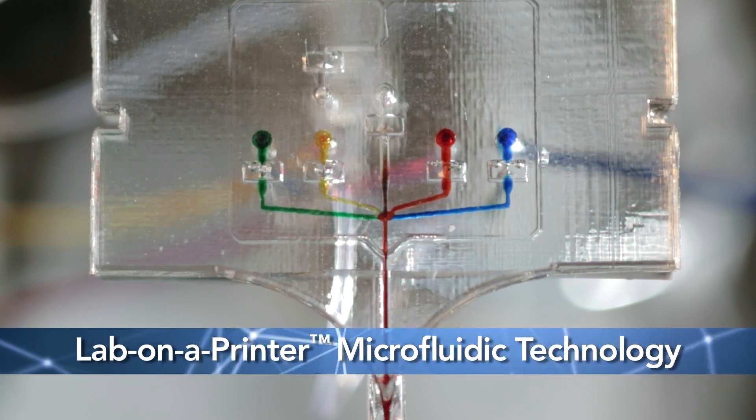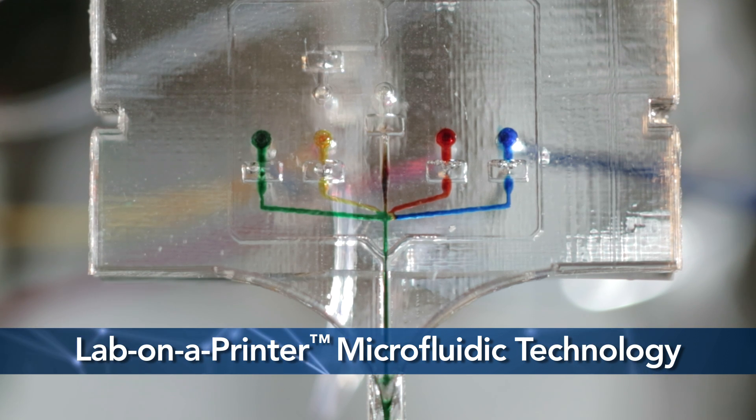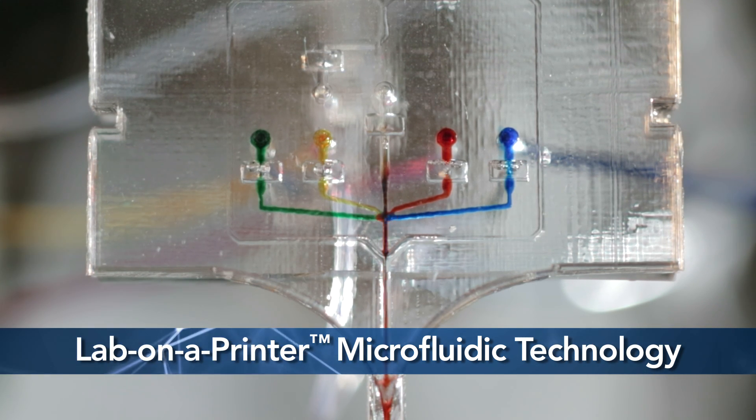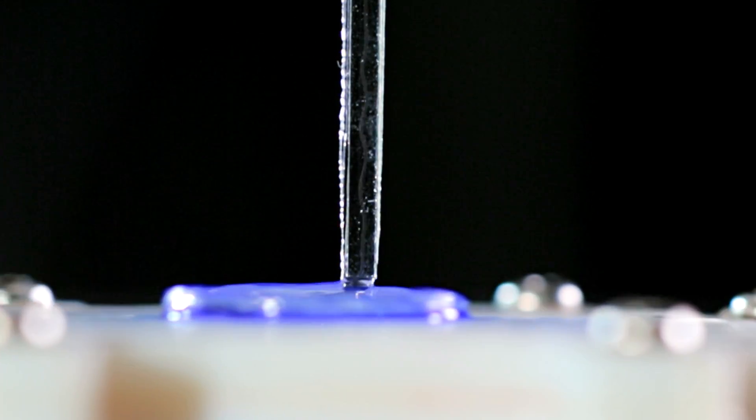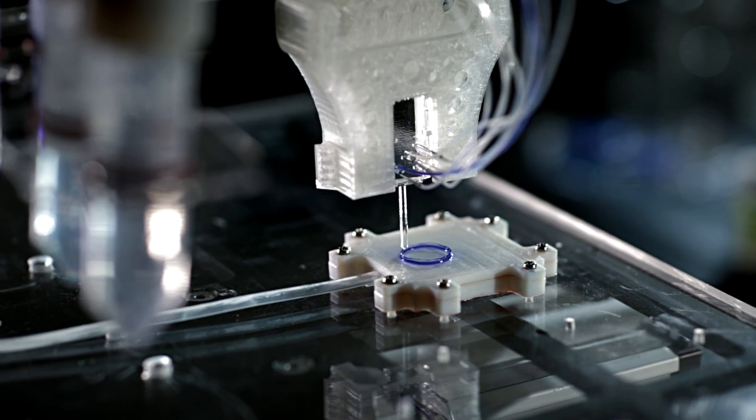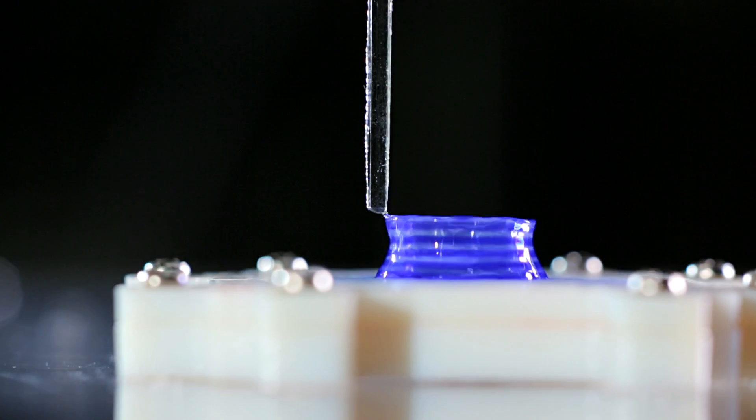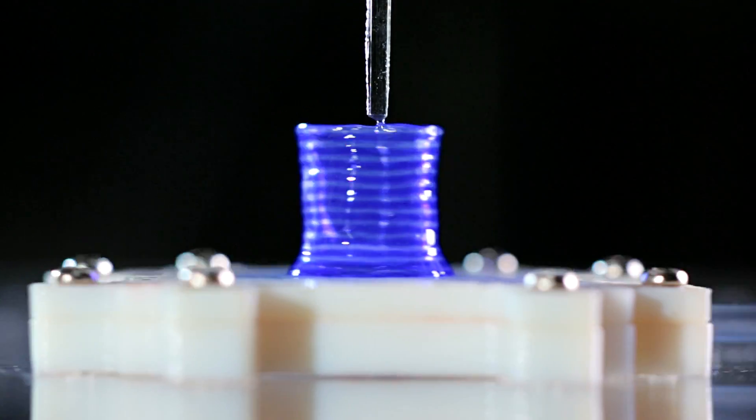Aspect's unique lab-on-a-printer microfluidic technology enables switching between different cell types and scaffold components on the fly. The living fibres we generate are deposited layer by layer to rapidly and accurately build heterogeneous tissues with well-defined regions.